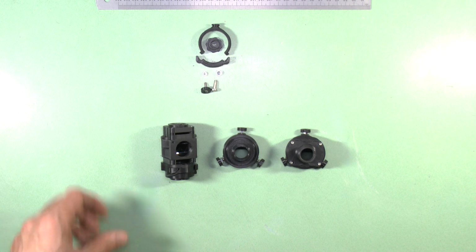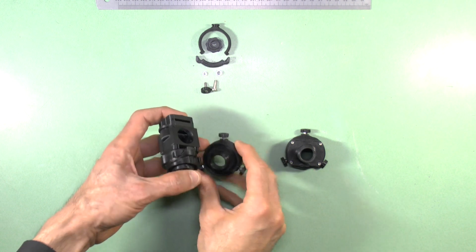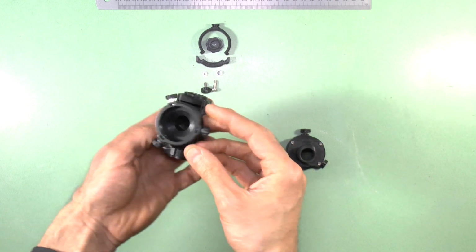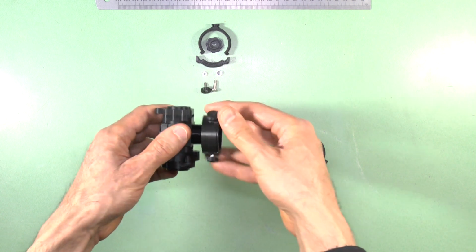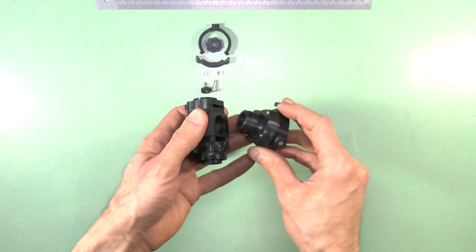When assembled, either of these connectors simply screws into the Epi-illumination port of the advanced filter block, as shown. The Epi-illumination port is the port that faces back towards the focus gears when the optical tube is inserted into the focus plate.